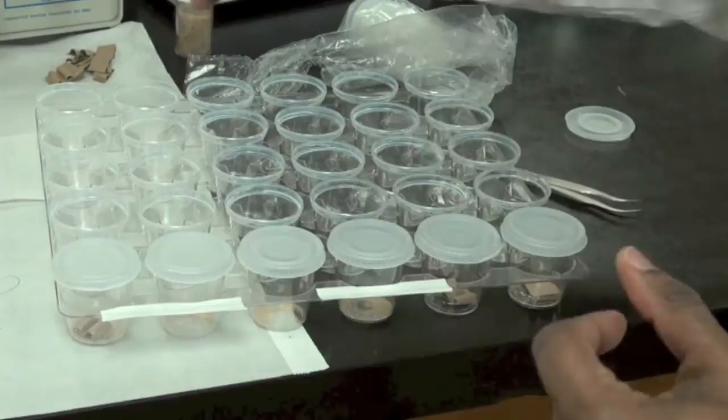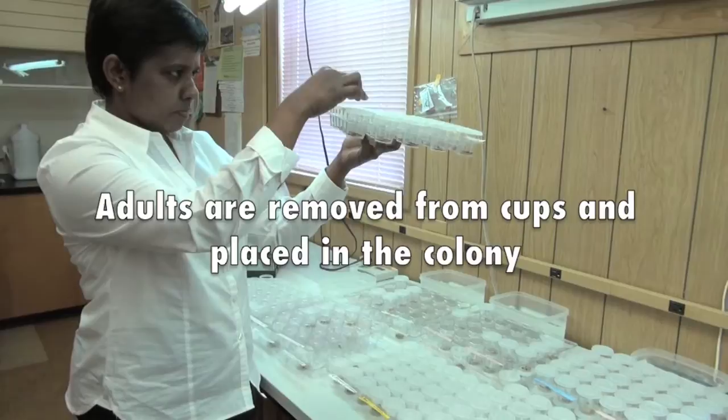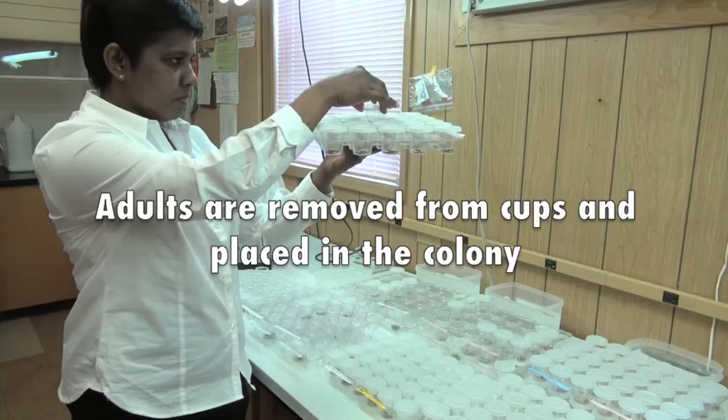For about 28 days — roughly close to one month — we can see the adults emerging. And then when we see the adults, we take the cup out and release them to the colony cage.